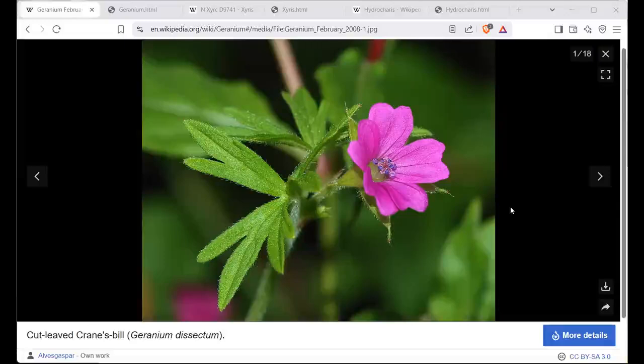And what I found was about 75 to 77% of all genera that we looked into have those standard patterns where you can clearly see the inverted repeats, the short single copy region and the long single copy region. And then a number of the other ones do not follow that pattern. So let me start with geranium.